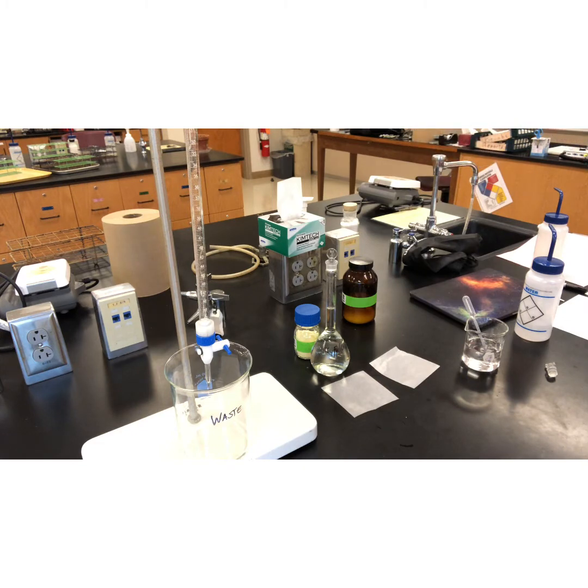All right, that looks pretty good. I don't see any more crystals floating around in there. So let's add a little bit more water.